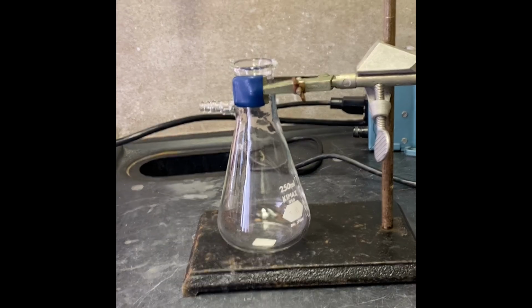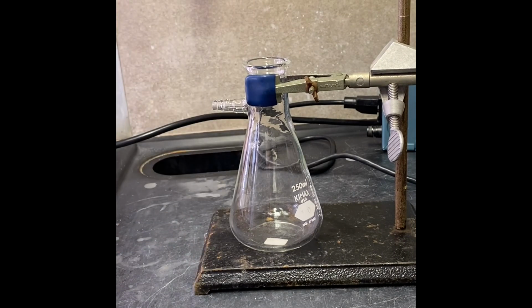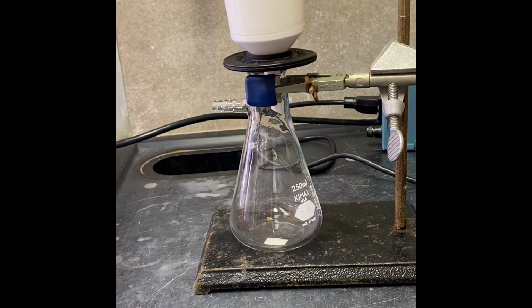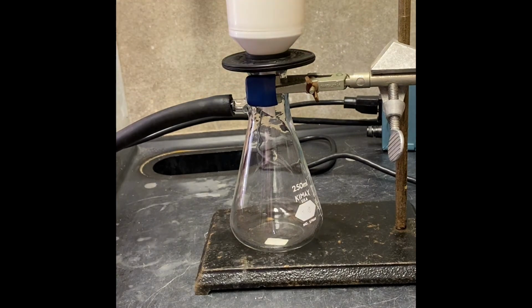We're gonna use the vacuum filtration for this reaction. So that's gonna be the vacuum filtration setup. I need the funnel, of course, right size of the paper goes inside, and adapter for the vacuum. So also I need the tubing, the vacuum connection, and that run for vacuum.